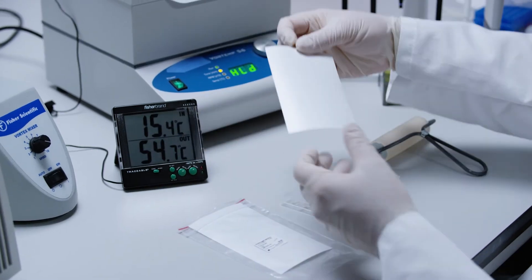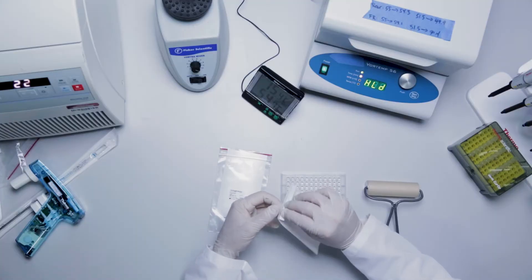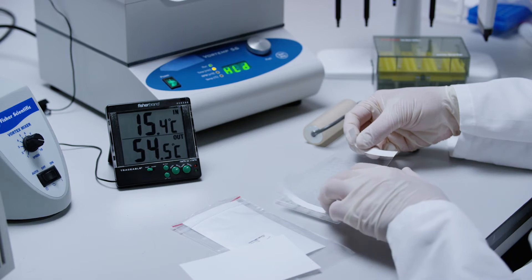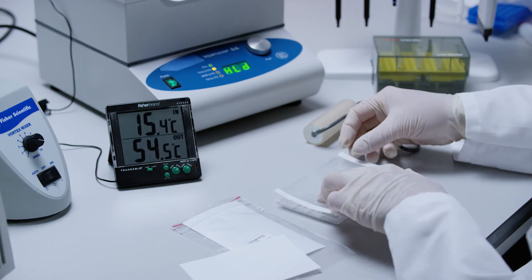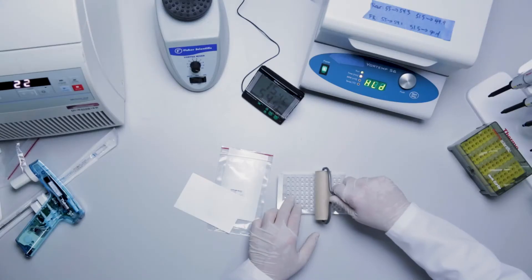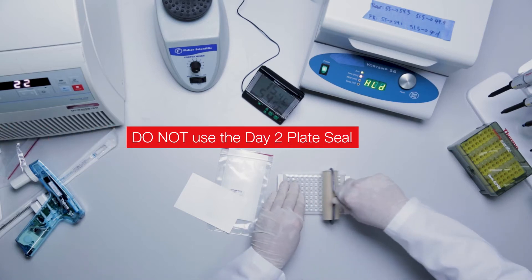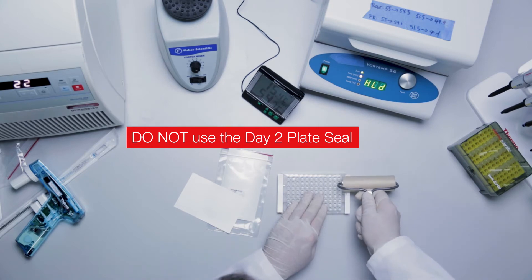Remove the backing of the pressure seal, center, and place onto the hybridization plate. Use a soft rubber roller or an applicator tool to apply firm even pressure to completely seal the plate. Ensure that all edges are properly sealed to avoid evaporation during overnight incubation.